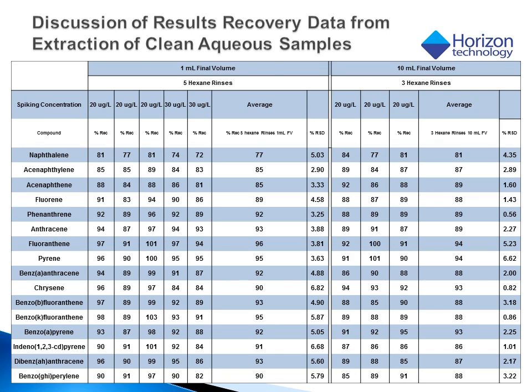There was slightly more loss again using the 5 mL rinses with the 1 mL endpoints of the lighter ends because of the additional sparge times needed to bring these to their respective endpoints. However, the heavier end components had slightly better recoveries.